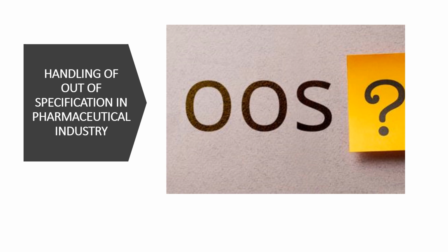So in this video, we will discuss about the handling of out of specification results in pharmaceutical industry, right?